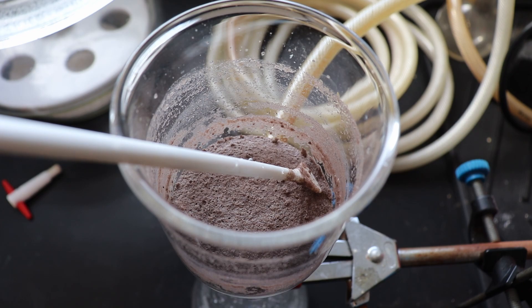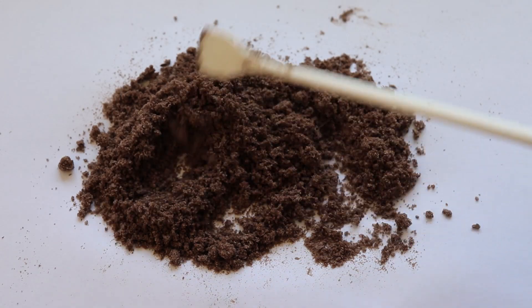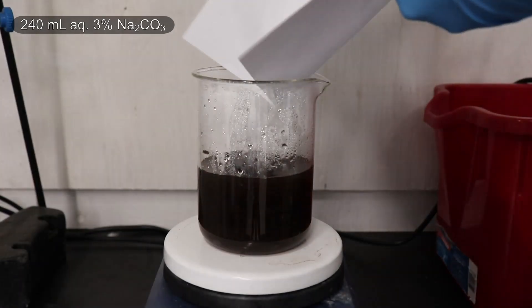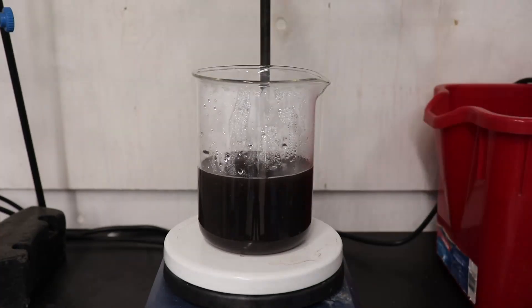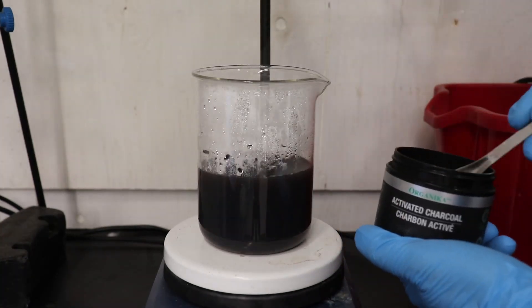After filtering, I was left with this brown solid. Next, 240 ml of a 3% sodium carbonate solution was prepared. The sodium carbonate solution was then heated until it was nearly boiling, and then the crude product was added and allowed to fully dissolve.